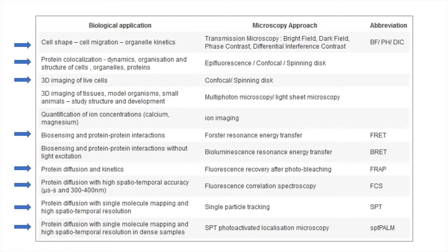It could look at three-dimensional fast processes. There are ways to detect fluorescence recovery after photobleaching, which I'm going to describe in a minute, as well as some of the processes of cell dynamics, organelle movement, etc.